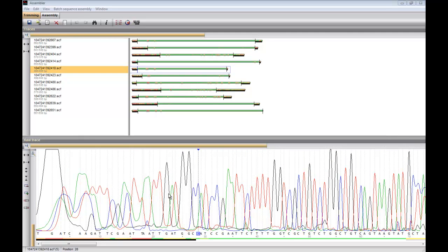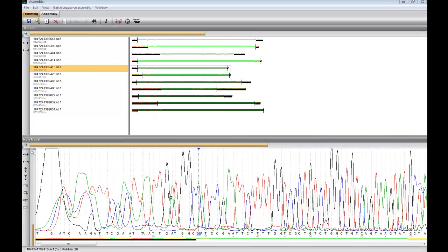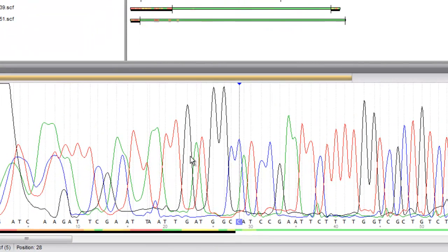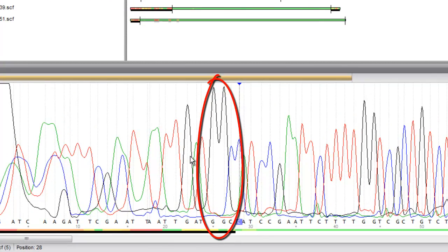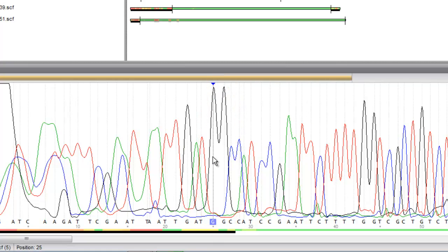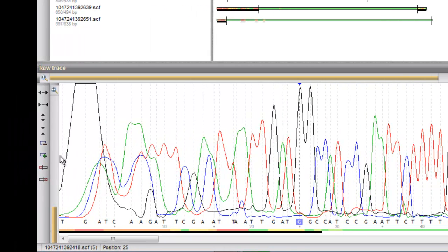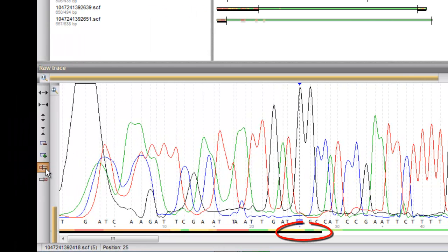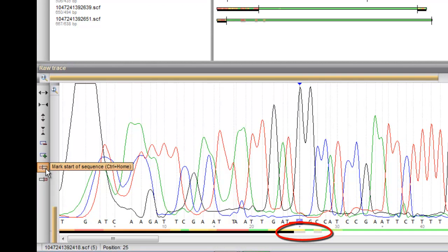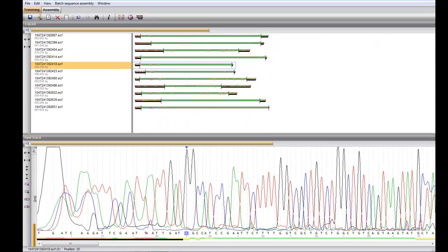Trimming ends can be adjusted manually. If I don't want these two black peaks to be trimmed off, I click on the first black peak and on Mark start of sequence. The black bar is removed from under the black peaks, meaning that they will no longer be trimmed off. The same goes for adjusting the end of a sequence.